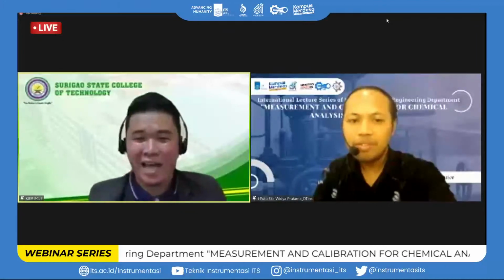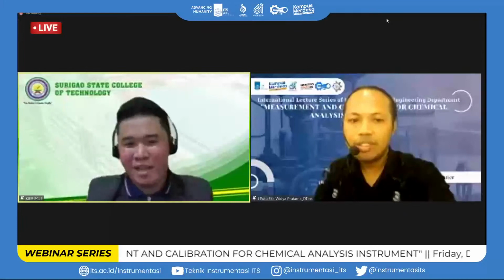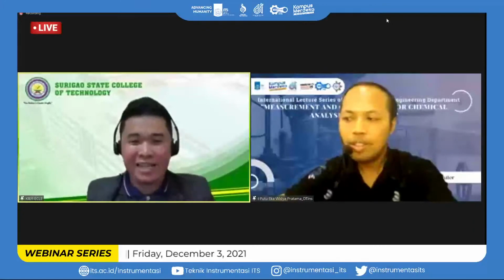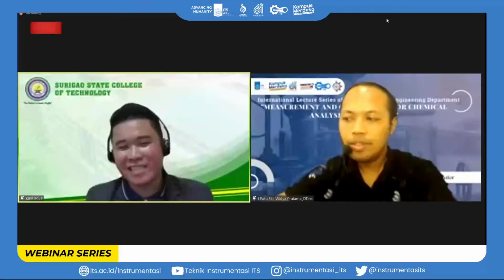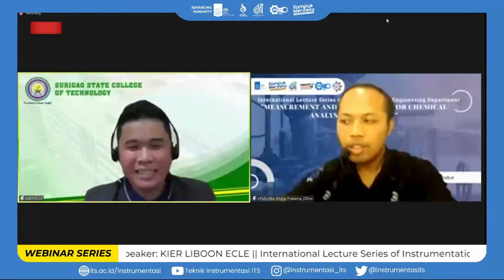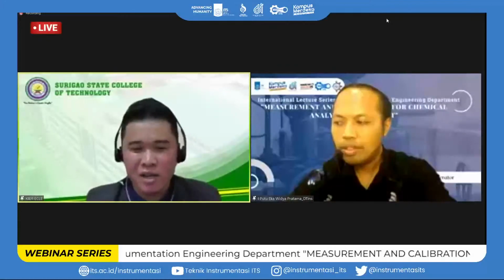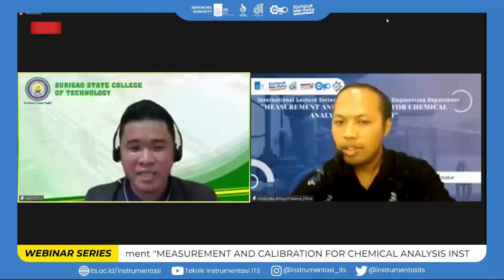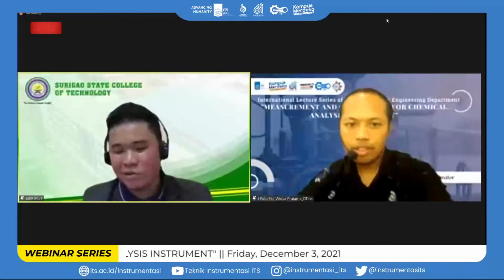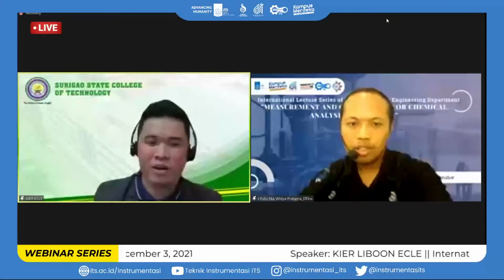Yes, sir. There are limitations for this particular spectroscopic method. For example, the solution must be in liquid form. You cannot simply put all of the samples that you want to determine into UV spectroscopy, because there are things we need to consider in running the sample solution, whether it is a known or unknown substance.